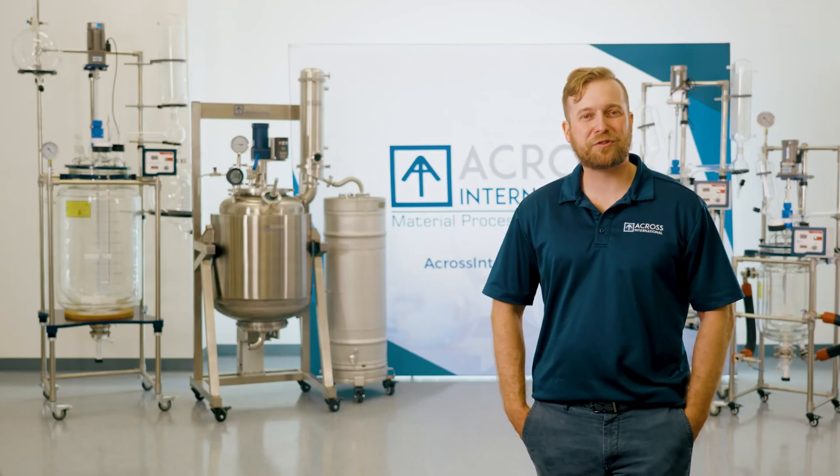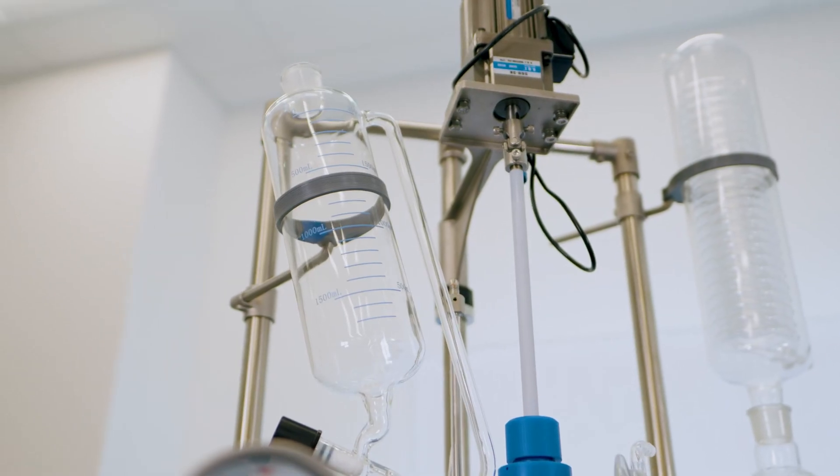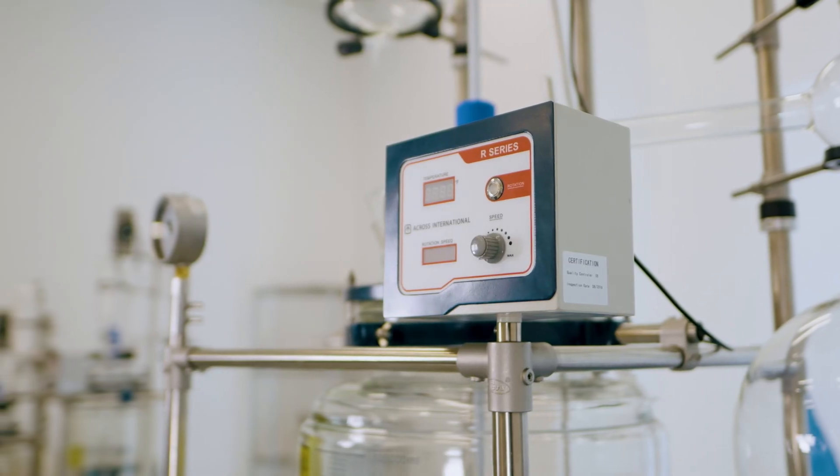Recrystallization. This process, sometimes referred to as isolation, can be done with various methodology, but for medium- to large-scale applications, the filter reactor reigns supreme. Jacketed filter reactors, paired with robust heater chillers, can allow for precise thermal cycling.